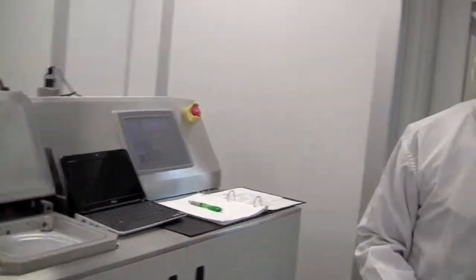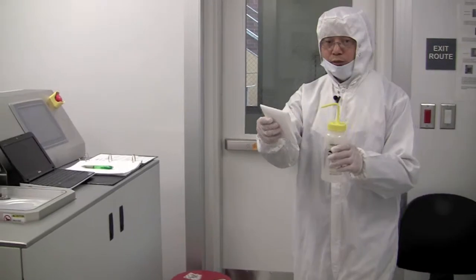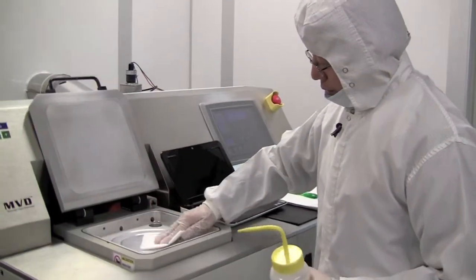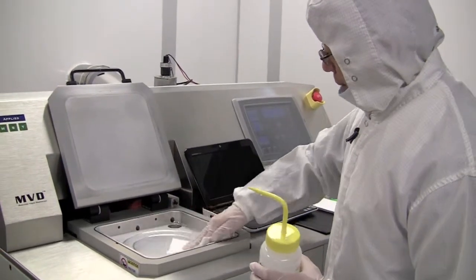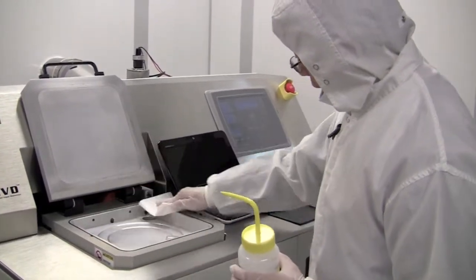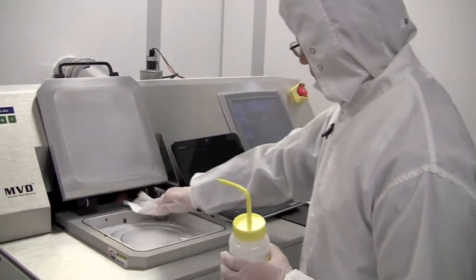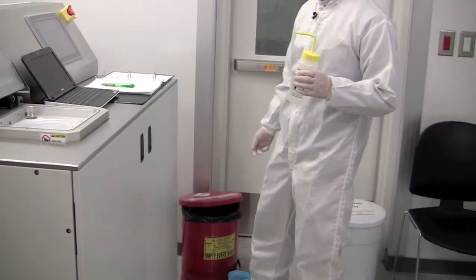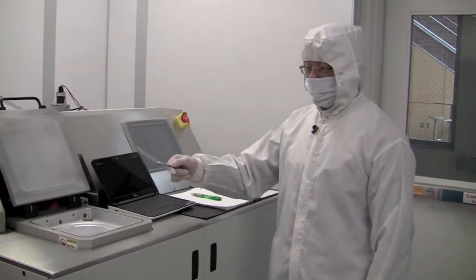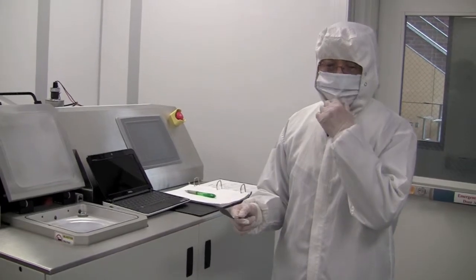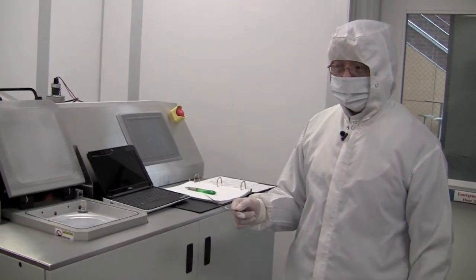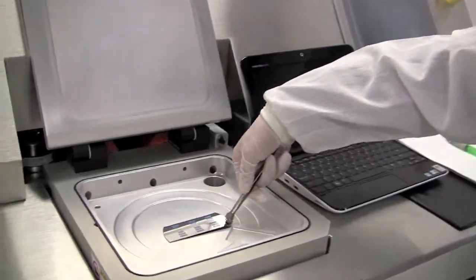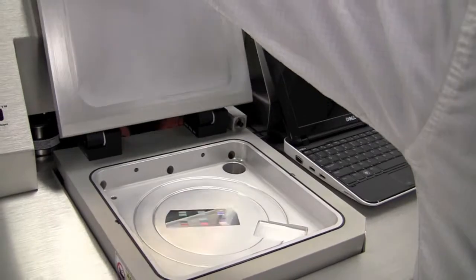Before we do that, we need to get a piece of clean room wipe and spray a little bit isopropyl alcohol. Clean up the chamber and the edge of the chamber. We put this waste into the flammable container. So before you load the sample, make sure you put on the mask to avoid contaminating the sample. So you put the sample into the center of the chamber and then close the lid.